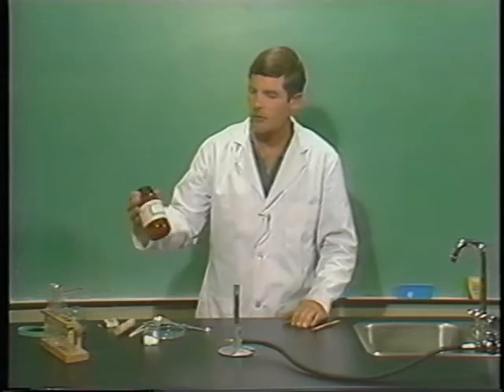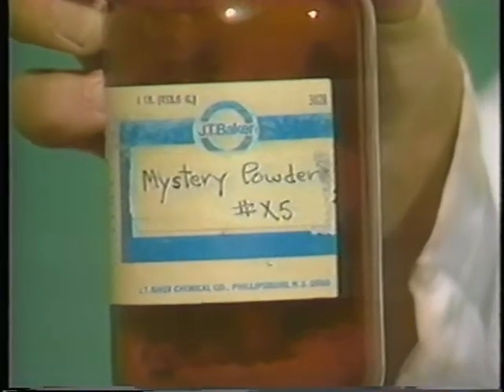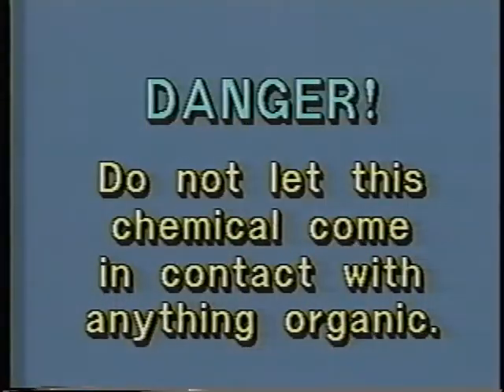We're going to be using a chemical called mystery powder number X5. And at the top of our instruction sheet, we see this big danger sign that says, don't let this chemical come in contact with anything organic. So we must know what the word organic means. And of course, that means anything that's alive now or was alive at one time.